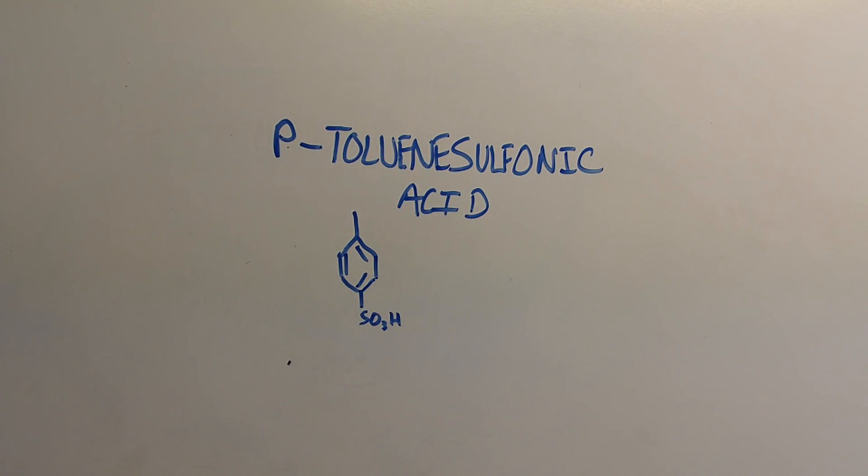Hi everyone and welcome back. Today I'll be making a compound called tosylic acid or para-toluene sulfonic acid using toluene and sulfuric acid.